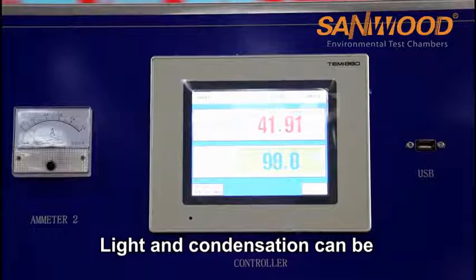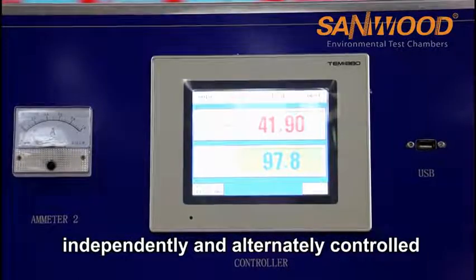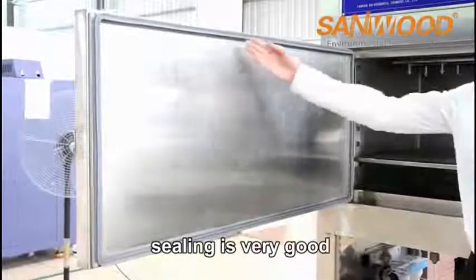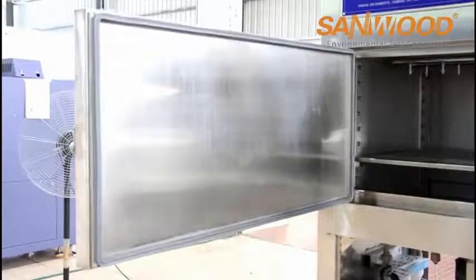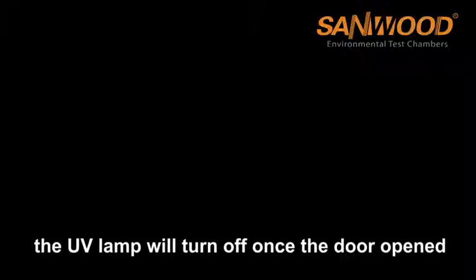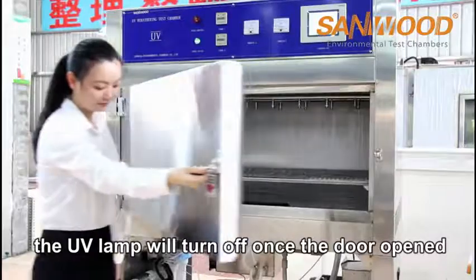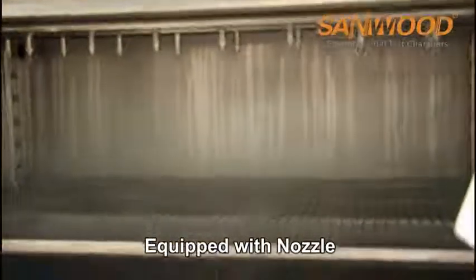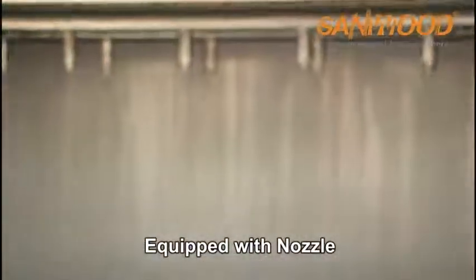Light and condensation can be independently and alternately controlled. The sealing is very good. As a protection function, the UV lamps will turn off once the door opens.